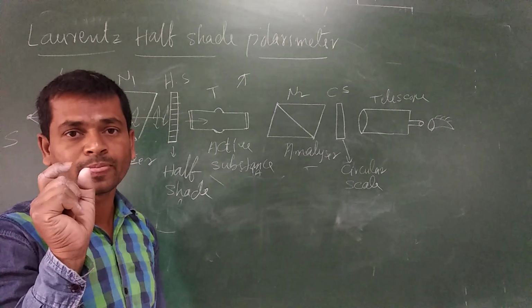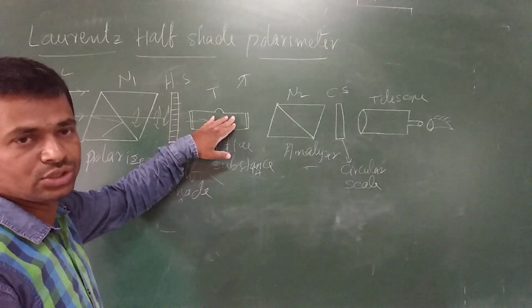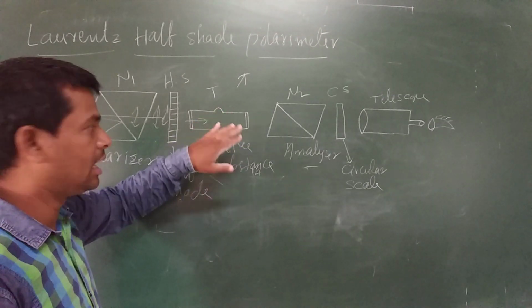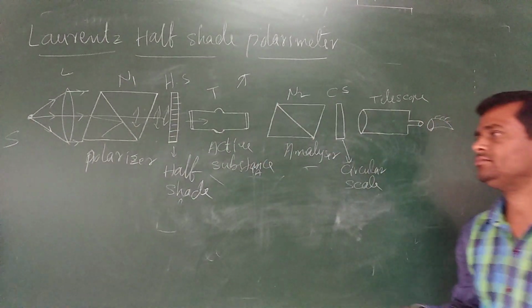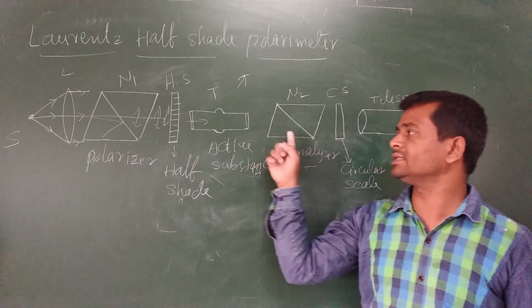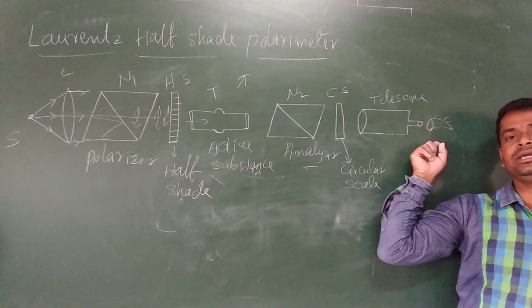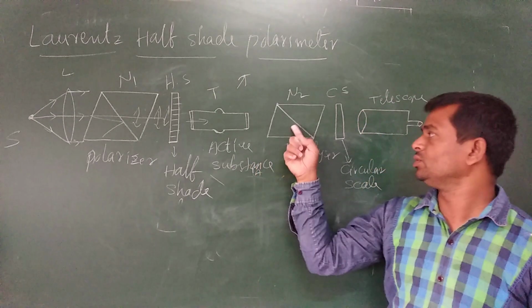First, what we have to do is the experiment with water. Take this tube, clean it with water, fill this tube with water, come to this side, and observe. When the analyzer and polarizer are parallel, the light appears on this side easily, and there is no need to rotate.